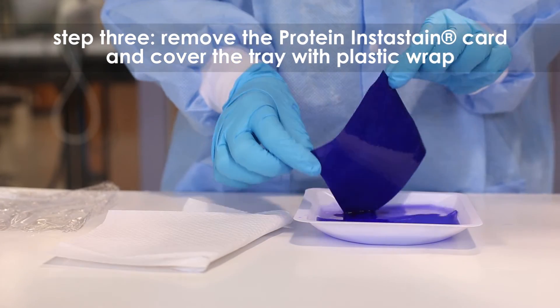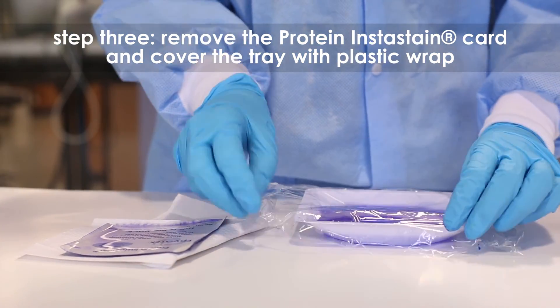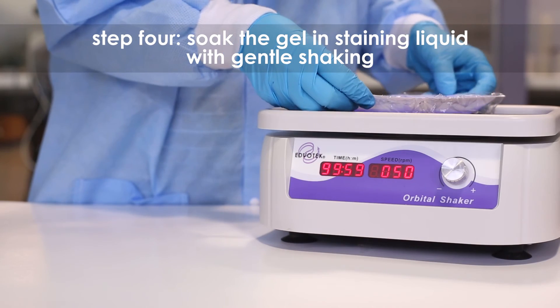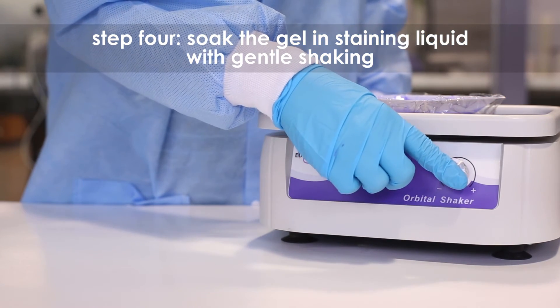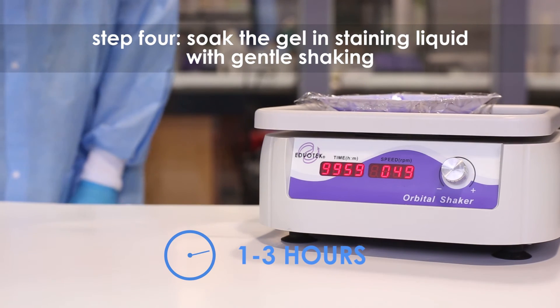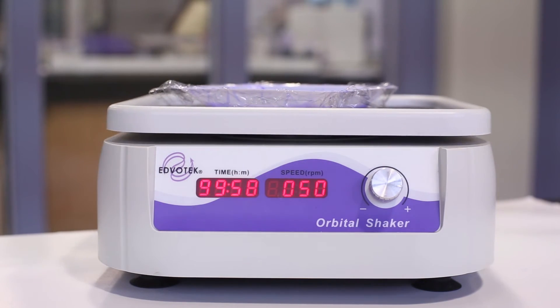Step 3. Remove the protein instastain card after 30 minutes. Cover the tray with plastic wrap to prevent evaporation. Step 4. Soak the gel in the staining liquid with gentle shaking for 1-3 hours. Longer periods will yield better results. The gel can remain in the staining liquid overnight.